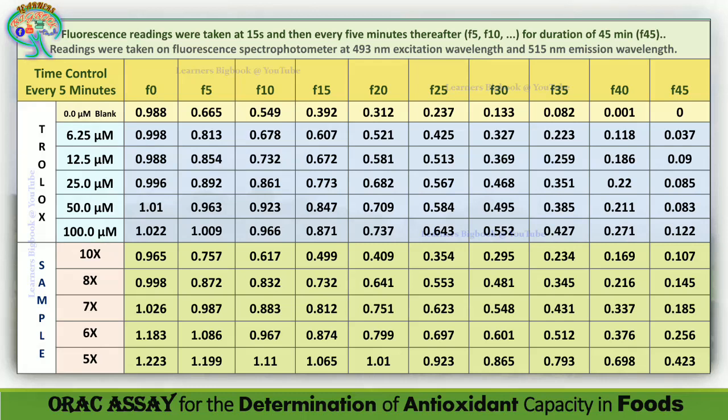What we have done here is to make sure that people can understand these kinds of readings. Taking readings this way is better compared to the microseconds or small timings mentioned in many other articles, because here we are very definite that the reaction has taken place.